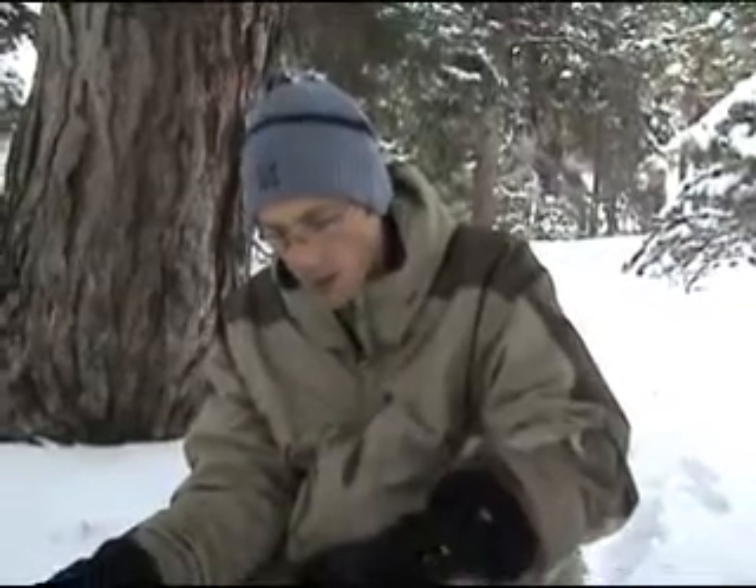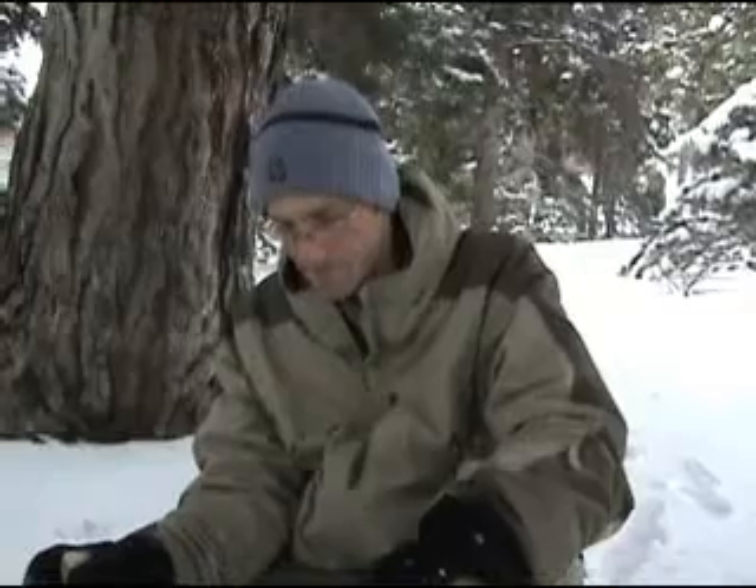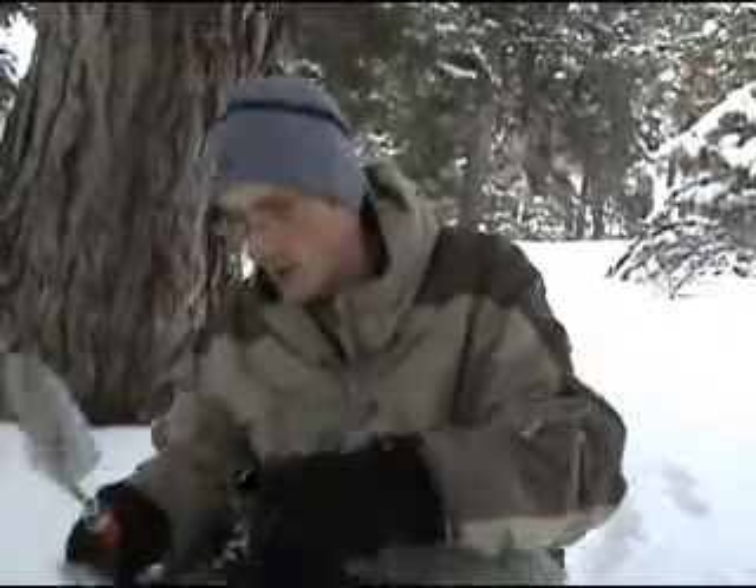We've got a good spot to dig. The ground's a little frozen, but that doesn't matter — all the microorganisms are still going to be there. We're here by some trees and bushes, which is a really good place because a lot of these insect pathogens form symbiotic relationships with roots, so we're probably going to have some good luck isolating from this soil.